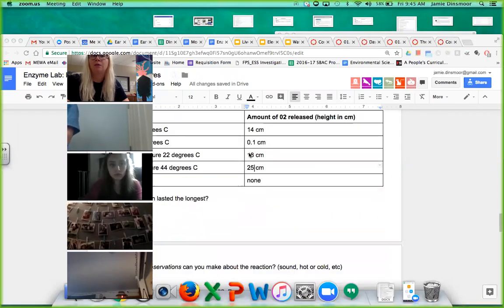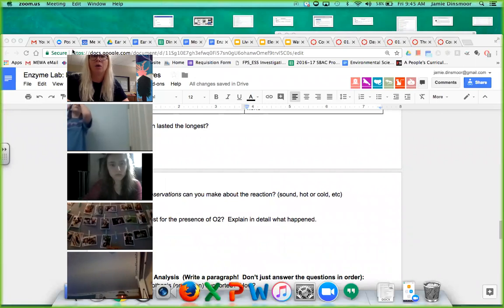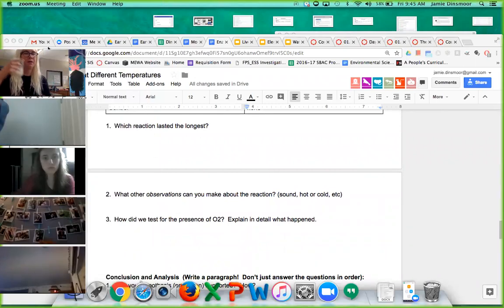So the rest of this lab is actually you just kind of describing your observations, right? You guys might not be able to hear it, but when the reaction's happening, it's really loud, right? It sounds almost like you're frying something. Yeah, like you're frying something, or I was going to say that cereal. Oh yeah, the Snap, Crackle, Pop cereal. What is that cereal? Rice Krispies. Rice Krispies. It's like making little popping sounds, right? Or when you're cooking bacon. Yeah, or like cooking bacon.